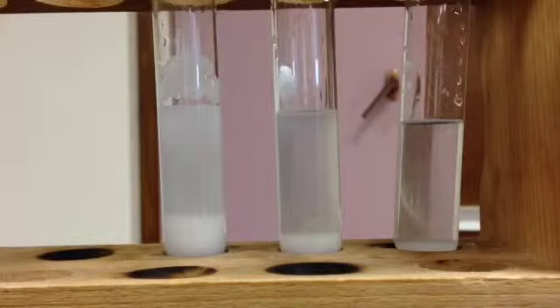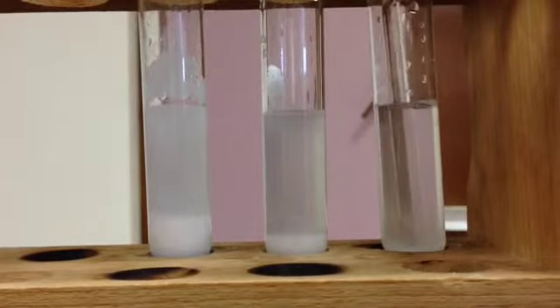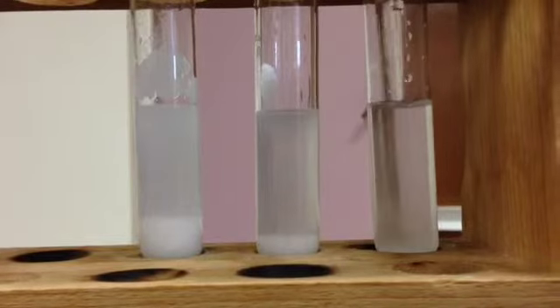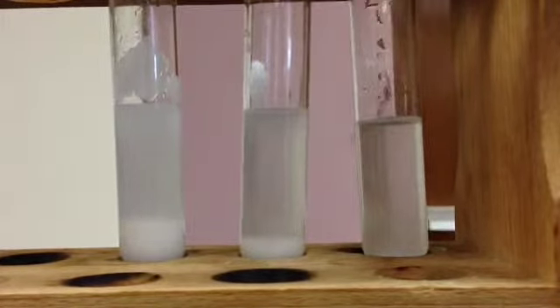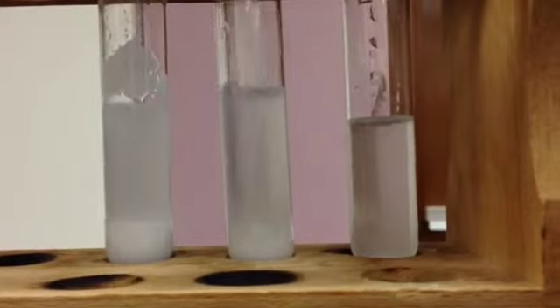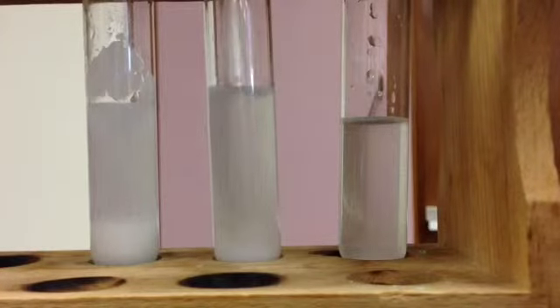Now I am using a stirring rod to stir the salt to make the dissolving process move quicker because the solute is being exposed to the solvent. The test tube in the middle and the test tube on the right will dissolve all the way because I did not use more than 3.62 grams, which is the maximum solubility for salt.